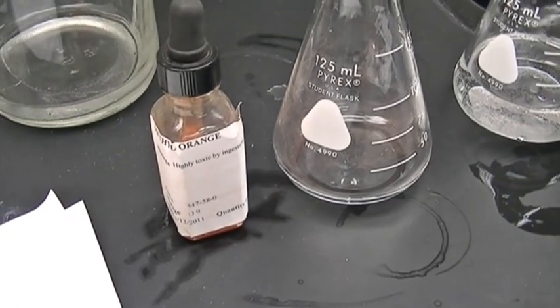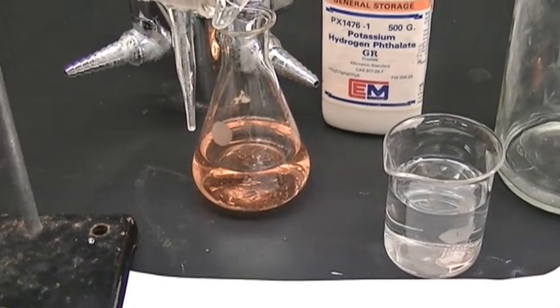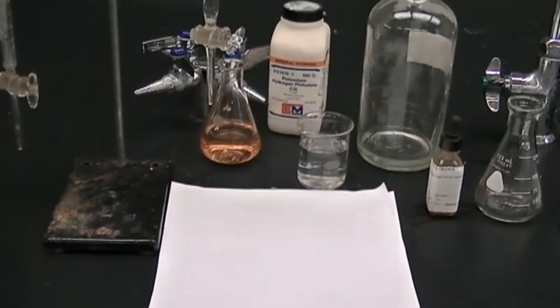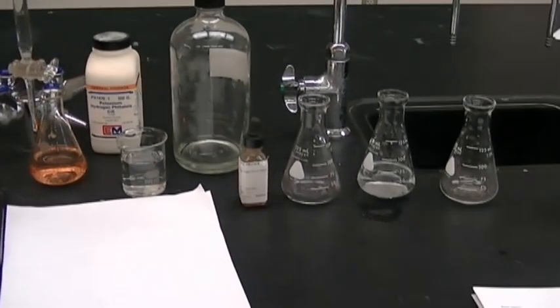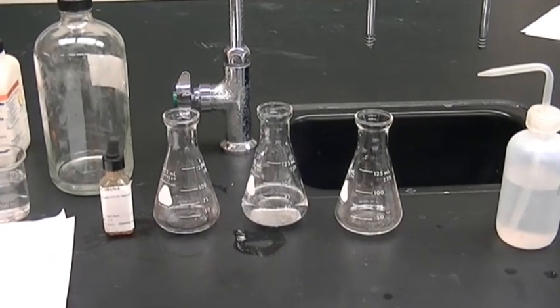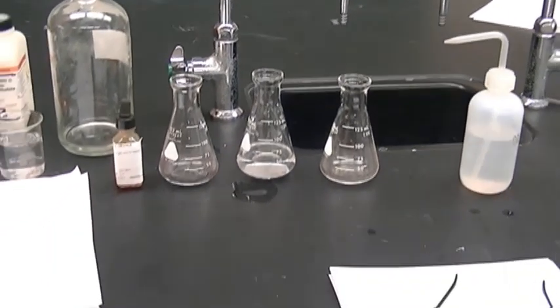So this is our methyl orange indicator. This is the color we're looking for in our titration. It is going to go from a yellow to a peachish orange color. All right, so we're going to do 3 titrations today. We're going to do 1 with the pure sodium carbonate. We're going to do 1 with just water to check our deionized water. And then the last one is going to be with our soda ash unknown number 55.